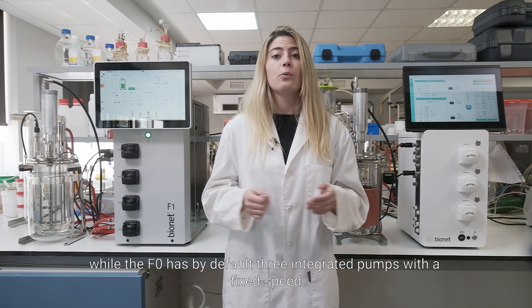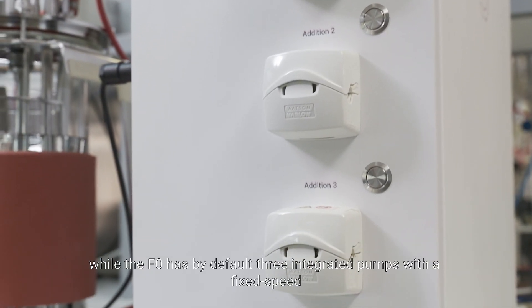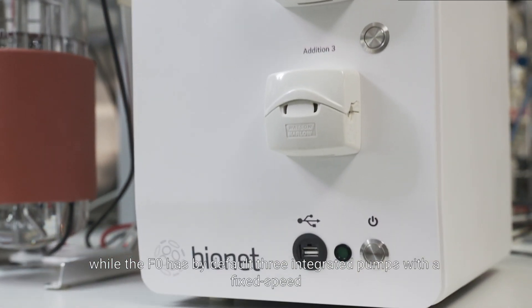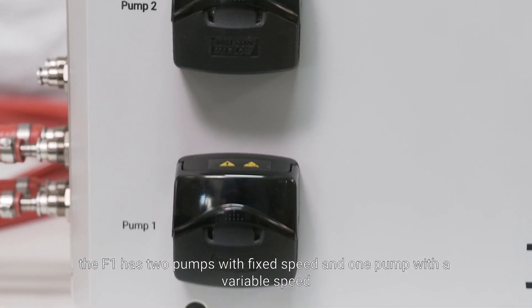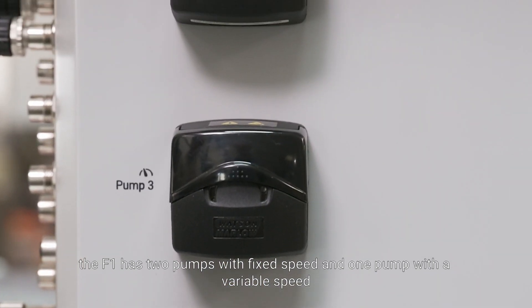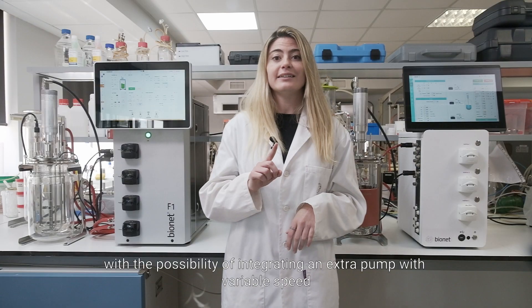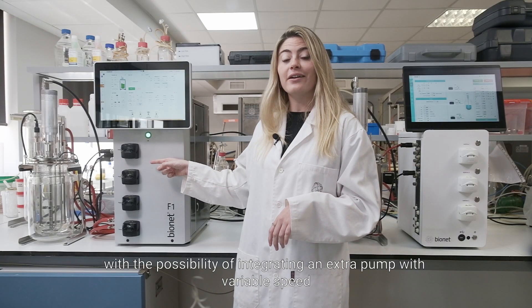Another difference is the pump configuration. While the F0 has by default three integrated pumps with a fixed speed, the F1 has two pumps with a fixed speed and one pump with a variable speed, with the possibility of integrating an extra pump with variable speed.